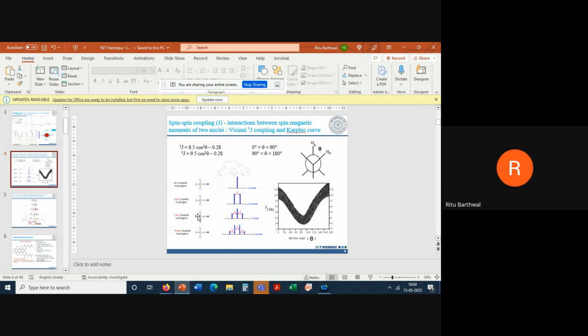So the next interaction that happens, you cannot help it. You have a molecule, and this H is a dipole sitting in its magnetic field, and the other is sitting in its magnetic field. They are a few angstrom away, which means quite a bit of interaction. This interaction is mu1 dot mu2 divided by r to the power of 6, because the two r cubes get multiplied. This interaction is what we call NOE, nuclear Overhauser effect.